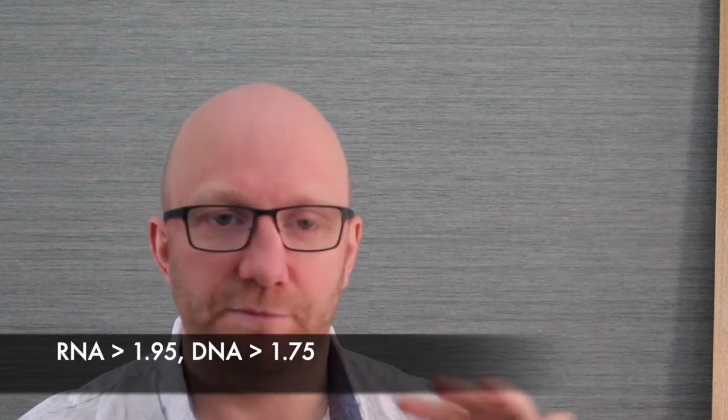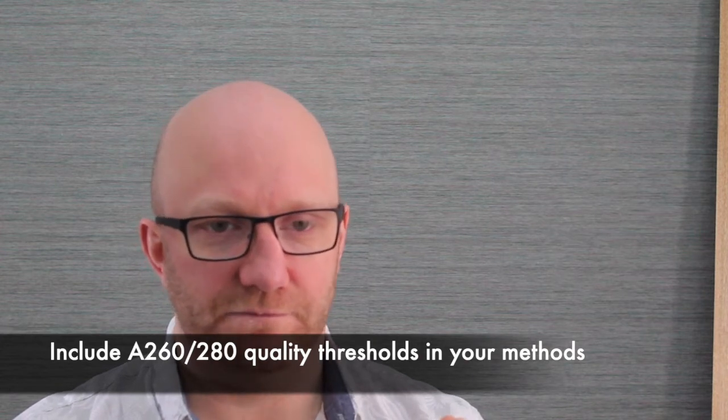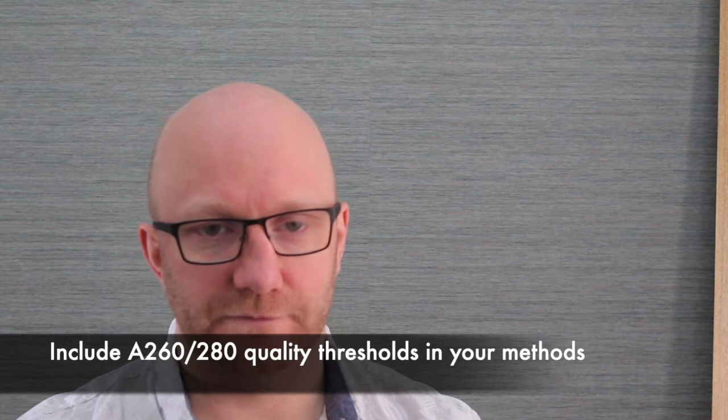Okay, what you have to do as the person designing your experiment is decide what is a good enough 260 divided by 280 ratio, meaning that your sample is appropriate for use in your experiment. So common cutoffs are maybe 1.95 for RNA, 1.75 for DNA, but you might decide that you have to accept less. For example, if you have very old or rare samples where your RNA quality is necessarily going to be worse. The important point is that this is a decision, and that means it has to be written into your methods, as it's relevant to the interpretation of your data.